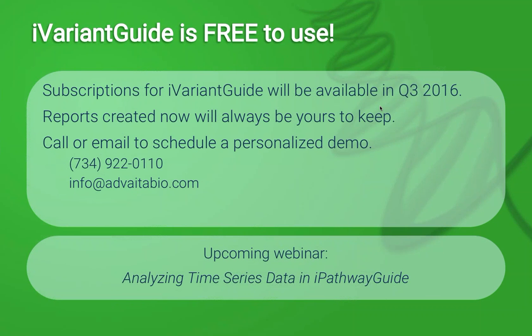Next question: what is the source of the pathway content? All of the sources of all of the annotations and data are available in the FAQ section of our website. But I can tell you that pathways come from KEGG. KEGG stands for the Kyoto Encyclopedia of Genes and Genomes, I believe. That's a good question.